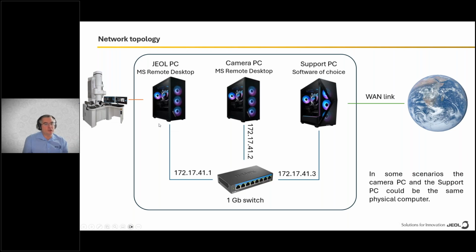Our JEOL PC normally runs on Windows, and we don't want Windows to call home and ask Microsoft to provide updates. That was possible some time ago, but right now with Microsoft releasing updates every week, it's just impossible for JEOL to test the updated version for compatibility with our microscopes. That would never work. That's why we say clearly that the JEOL PC should not be connected to the internet.